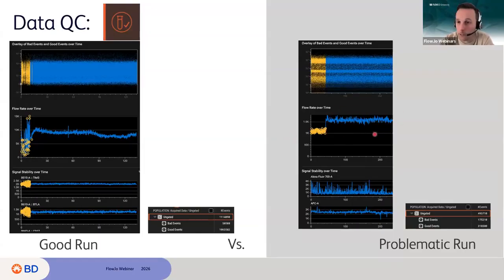Well, if that's the case for you and you have a sample like that, you can just turn off the flow rate check to make sure that it keeps everything from your sample. And best practice, if you know that you're going to run the QC, just make sure that you change the speed between samples and not within the sample.